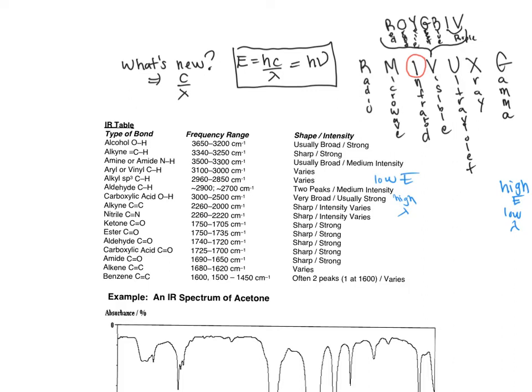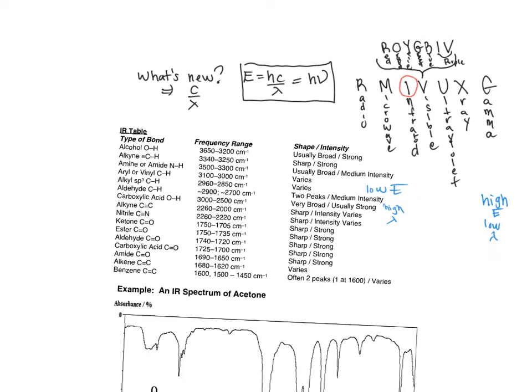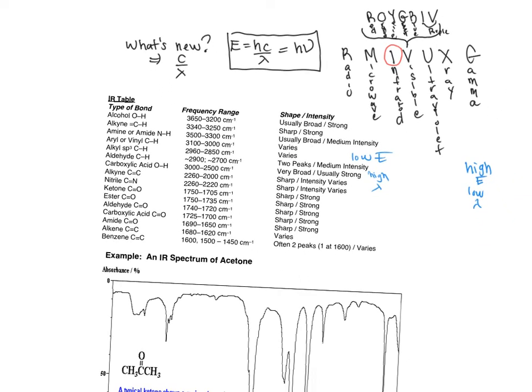And since our convention as chemists is to report this in inverse centimeters, you might, if in a physics class, report it as nanometers. But this is reported as inverse centimeters. That's how it works out to be in the 4,000, probably is our highest max that we'll ever look at, down to maybe 1,200, 1,000. But notice that the ones that you're going to be identifying frequently, and I actually do provide this chart on exams as a reference. It's allowed, except for the final, because it allows you to identify what the functional groups are without having to memorize it. But you could see trends.